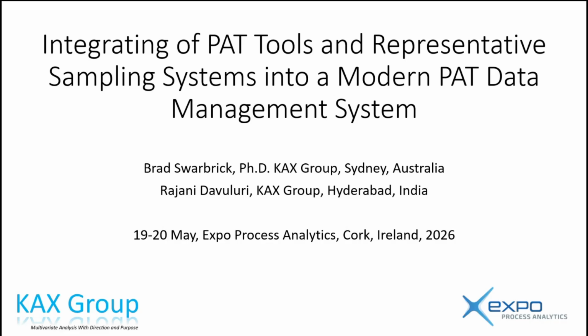Okay, tumble blending. This is the machine that goes ping. Everybody loves their tumble blender. You talk to anybody in the pharmaceutical industry: oh, can we put an NIR into a tumble blender? Yep, I remember the very first instruments that came out. They made no contact with the Wi-Fi, and so you lose all your batch data. There was no way to back it up.